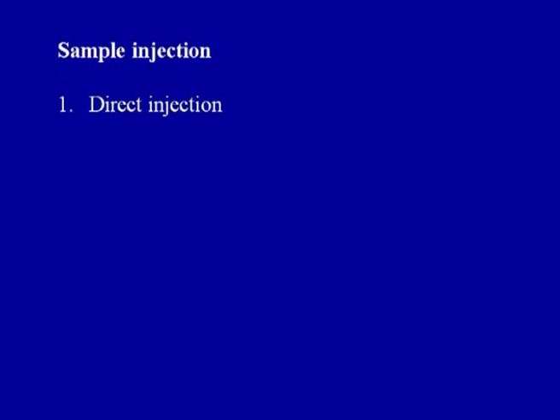Now, as carrier gas goes on, the next thing is the sample injection. Many times certain chemistry is involved to prepare the sample, and maybe derivatization or other things might be required to vaporize the sample, because not all the compounds could be vaporized. So, this is a limitation of gas chromatograph. When we do sample injection, the sample has to be vaporized, so that it can partition between the stationary liquid phase and the mobile gas phase.